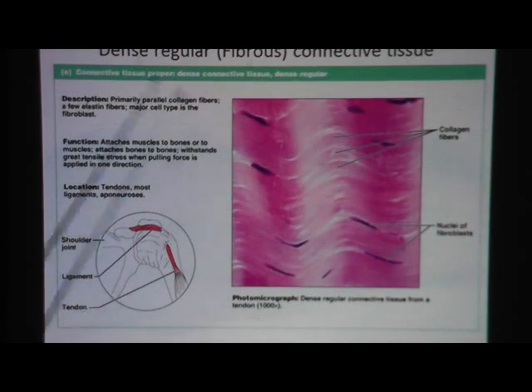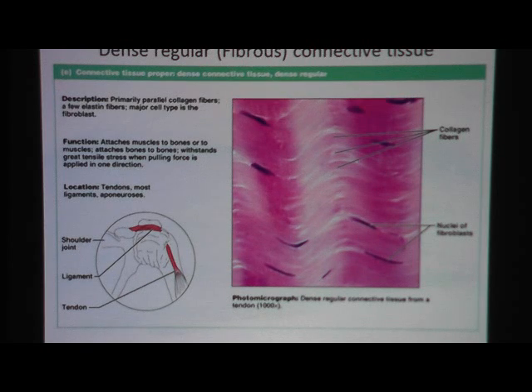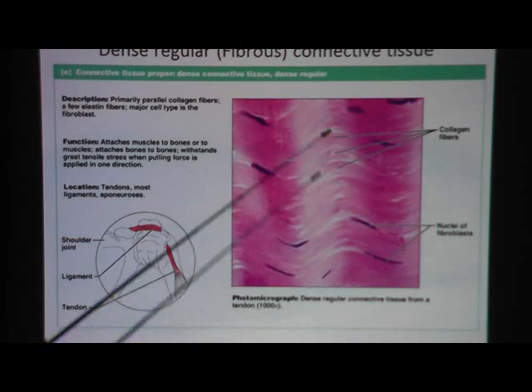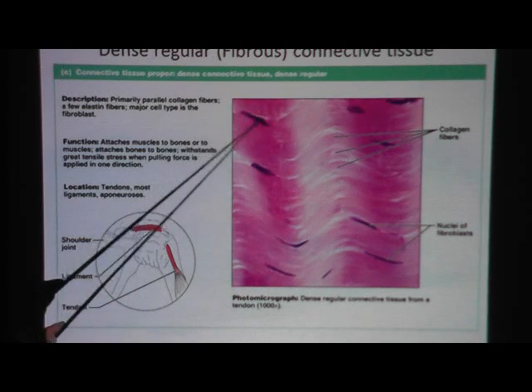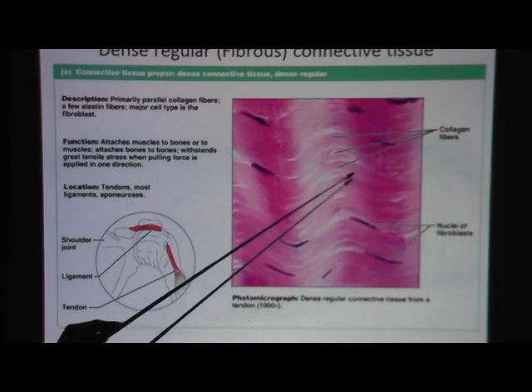Dense regular or fibrous connective tissue is the full name. I like the name dense regular because it's very descriptive. When you think of the word dense, dense is something that's packed, full of stuff. And that's what this picture seems like. There's just a lot of stuff here, very little white spaces, because it's just chock full of collagen fiber.